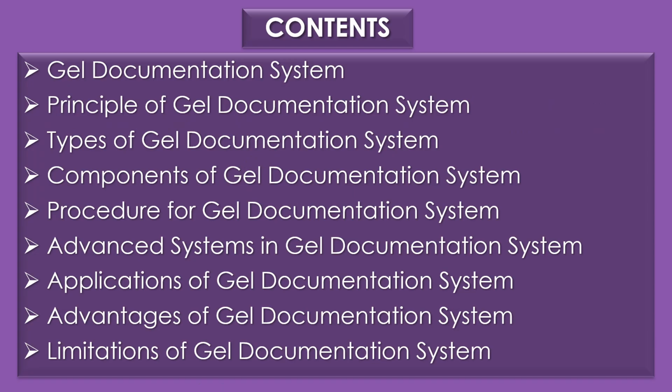This video contains the following contents. First, an introduction about gel documentation system, followed by principle of gel documentation system, types of gel documentation system, components of gel documentation system, procedure for gel documentation system, advanced systems in gel documentation system, applications of gel documentation system, advantages of gel documentation system, and finally limitations of gel documentation system.